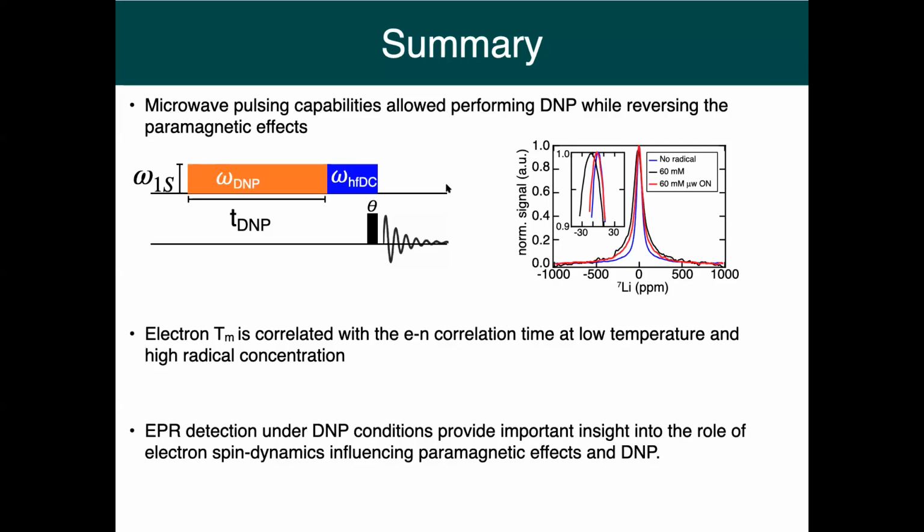Agreed, but the question is, from the point of view of the end result of the DNP, is there any merit in combining these two approaches? Although you claim that irradiation of microwaves during the acquisition of the NMR FID doesn't seem to make a difference, that seems to be somewhat at odds with the earlier findings I'm talking about.